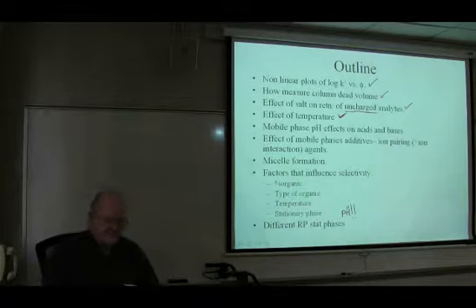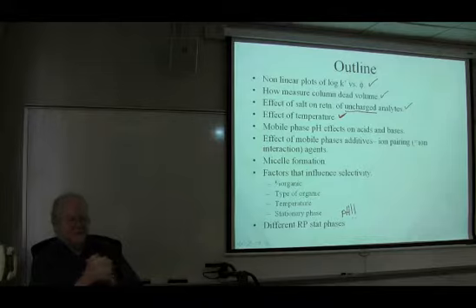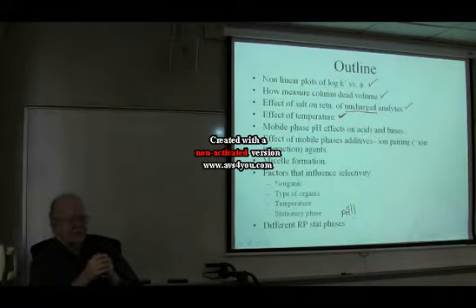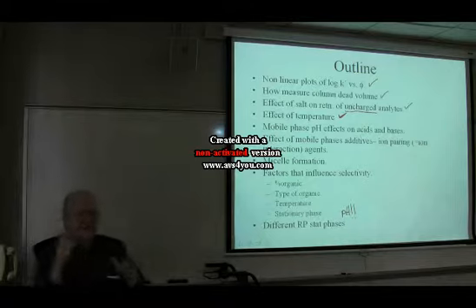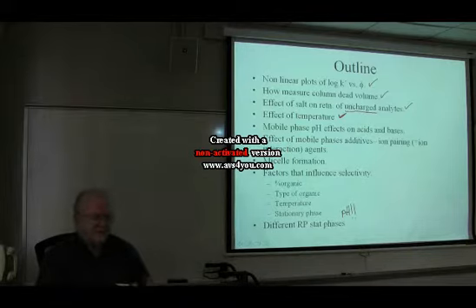In the early days, LC was so irreproducible that people didn't pay much attention to temperature, because 1 or 2 degrees just don't matter much. But we now know how to do LC sufficiently reproducibly that the temperature does matter, and so it is necessary to control the column temperature.